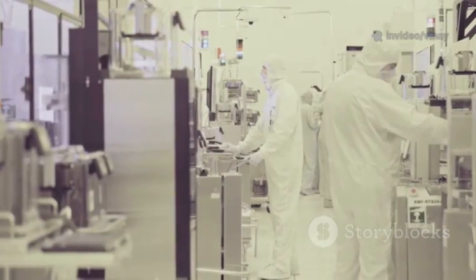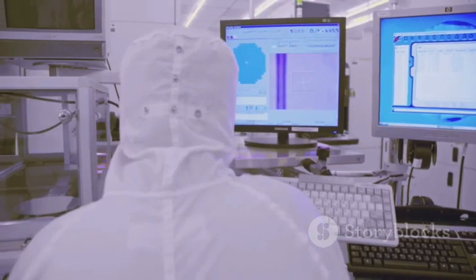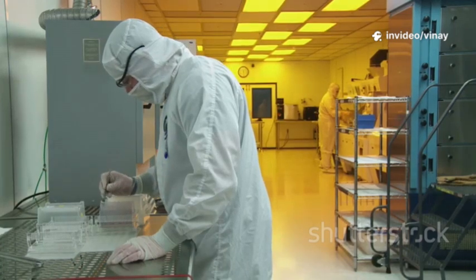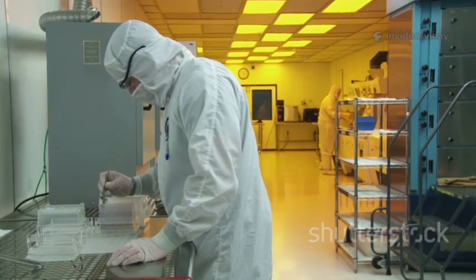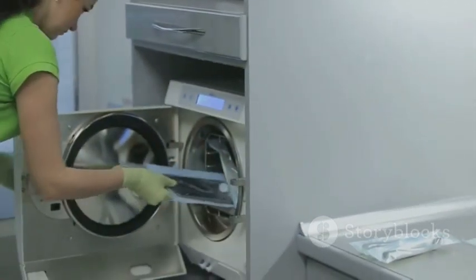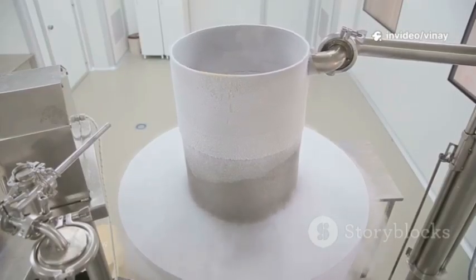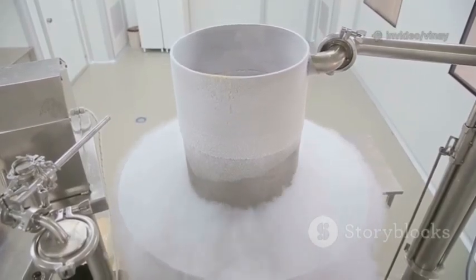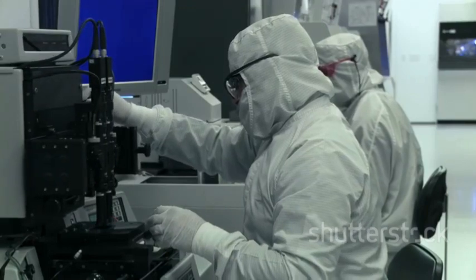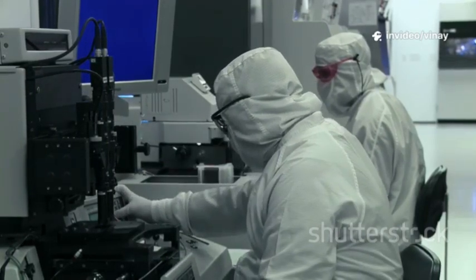This human factor is so important that operators must prove their competence through rigorous qualification programs, including periodic participation in media fill simulations. Equally important is the proven sterility of all equipment and components that come into contact with the drug. Validated sterilization processes, whether using steam, dry heat, or other methods, provide the necessary assurance that these items are free from microbial life before they are introduced into the aseptic core. This, combined with a robust environmental monitoring program that continuously verifies the state of control of the air and surfaces, creates multiple layers of protection.